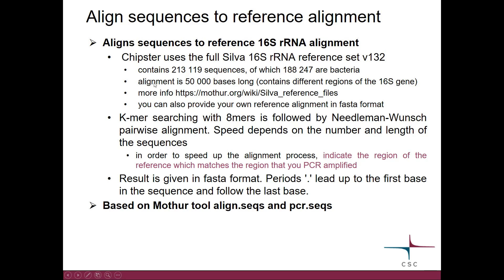The reference alignment is very long since it contains the different regions of the 16S gene. You can read more about it at the Mothur site. You can also provide your own reference alignment in FASTA format if needed.